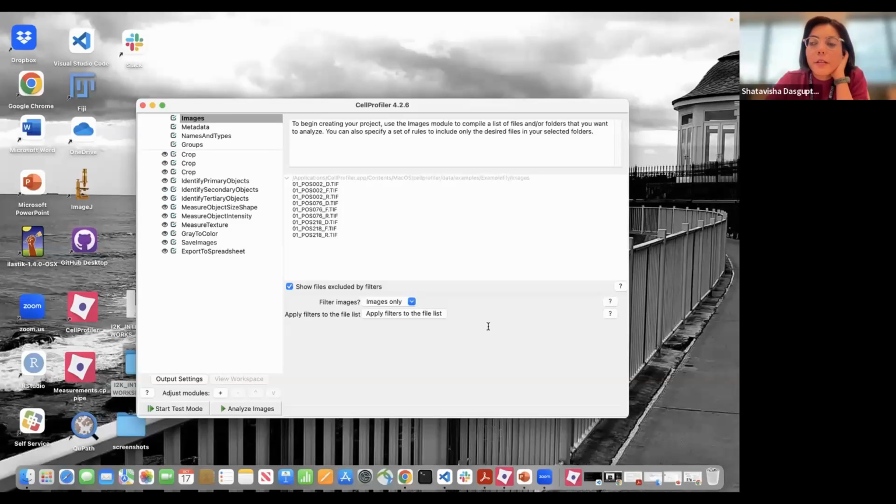Otherwise, as I mentioned, you can post your question on forum.image.sc, or CellProfiler also conducts office hours. That might also be a good resource to reach out to. And yes, CellProfiler can work on a 96 or 12 plate.